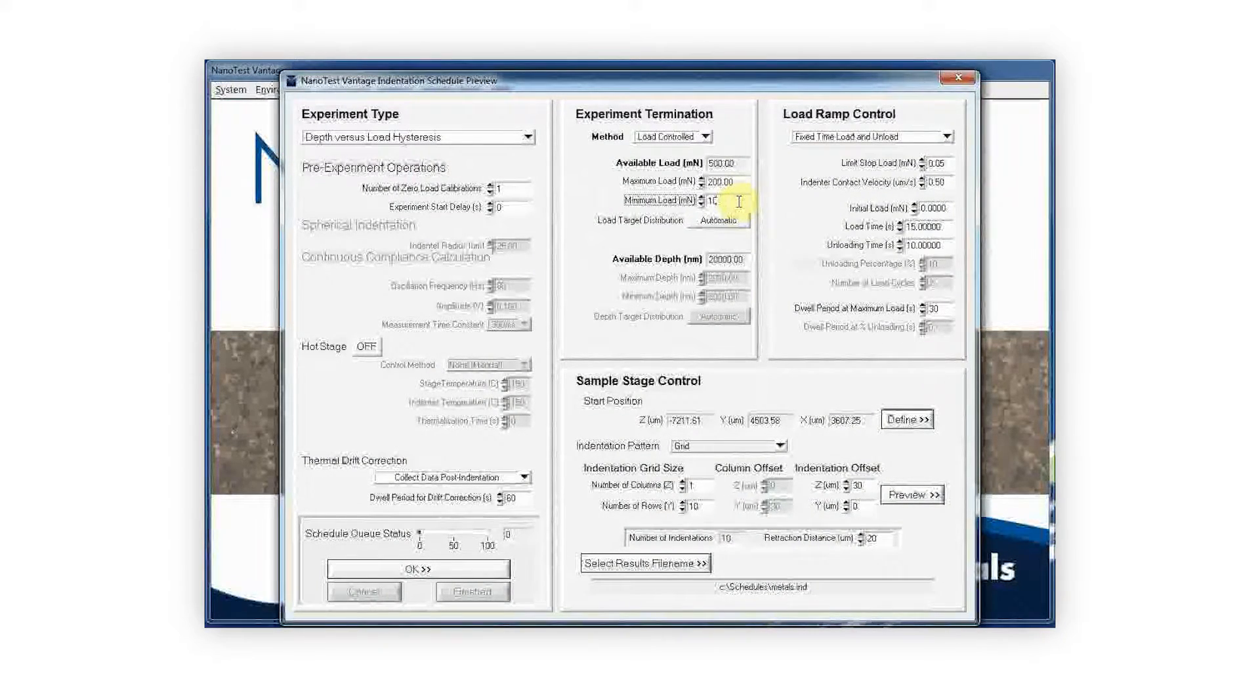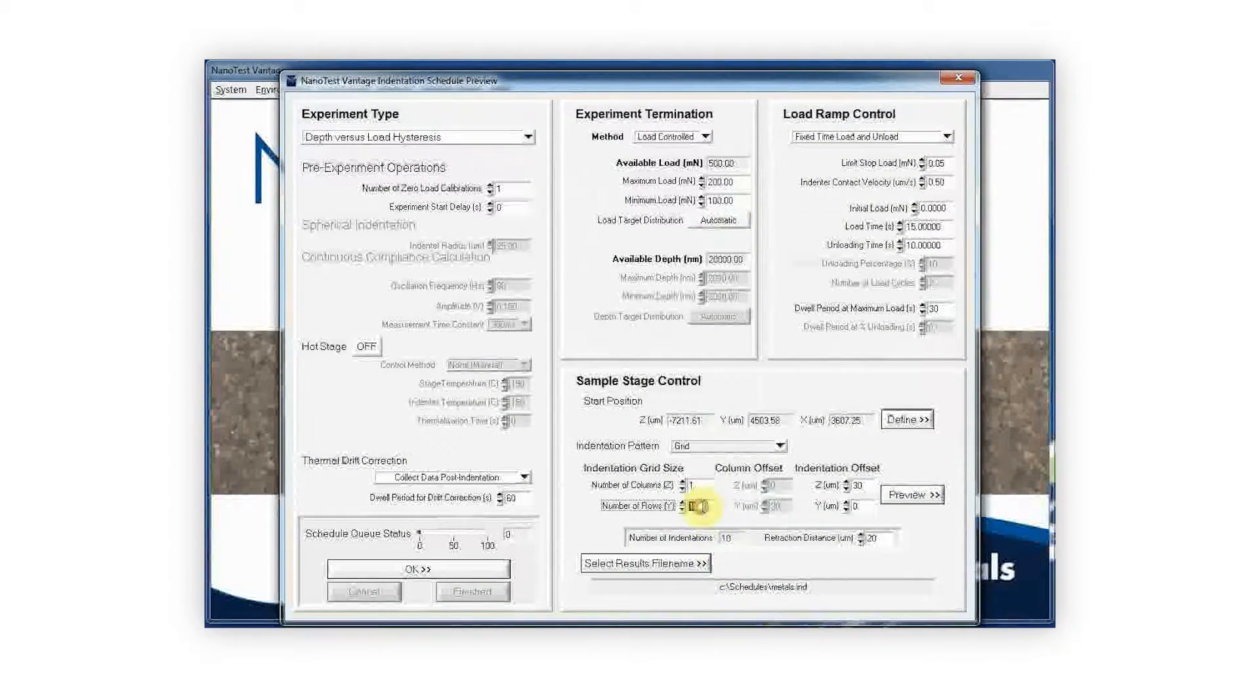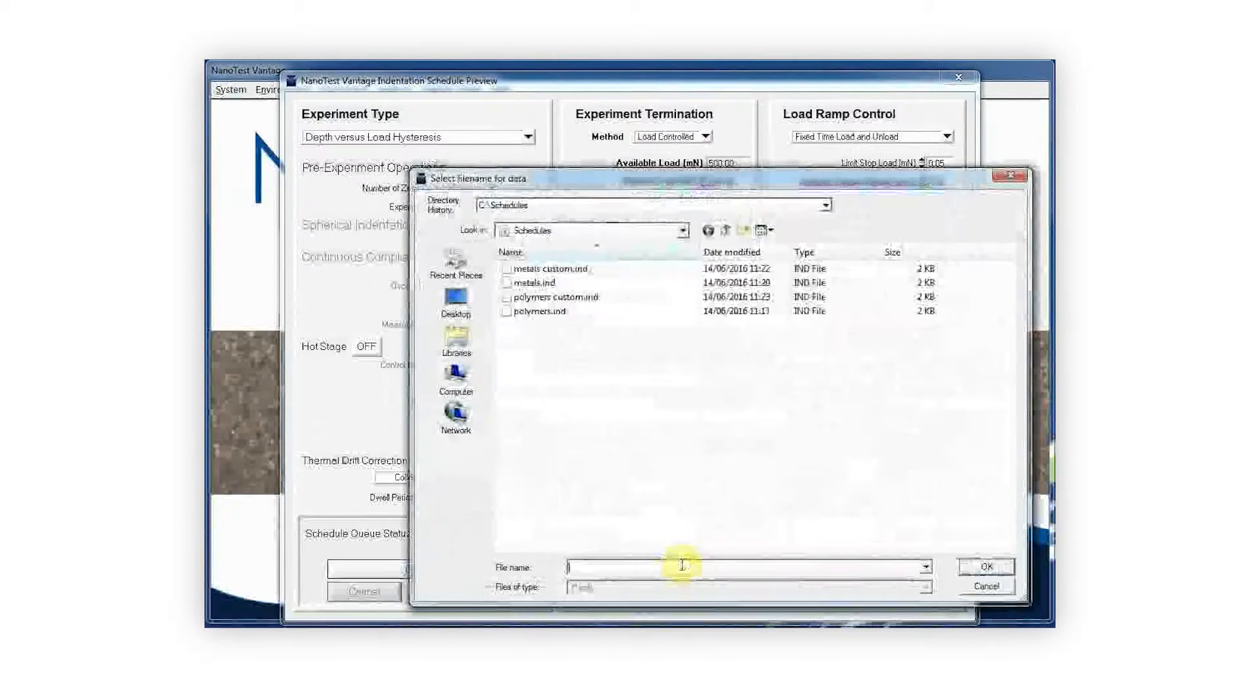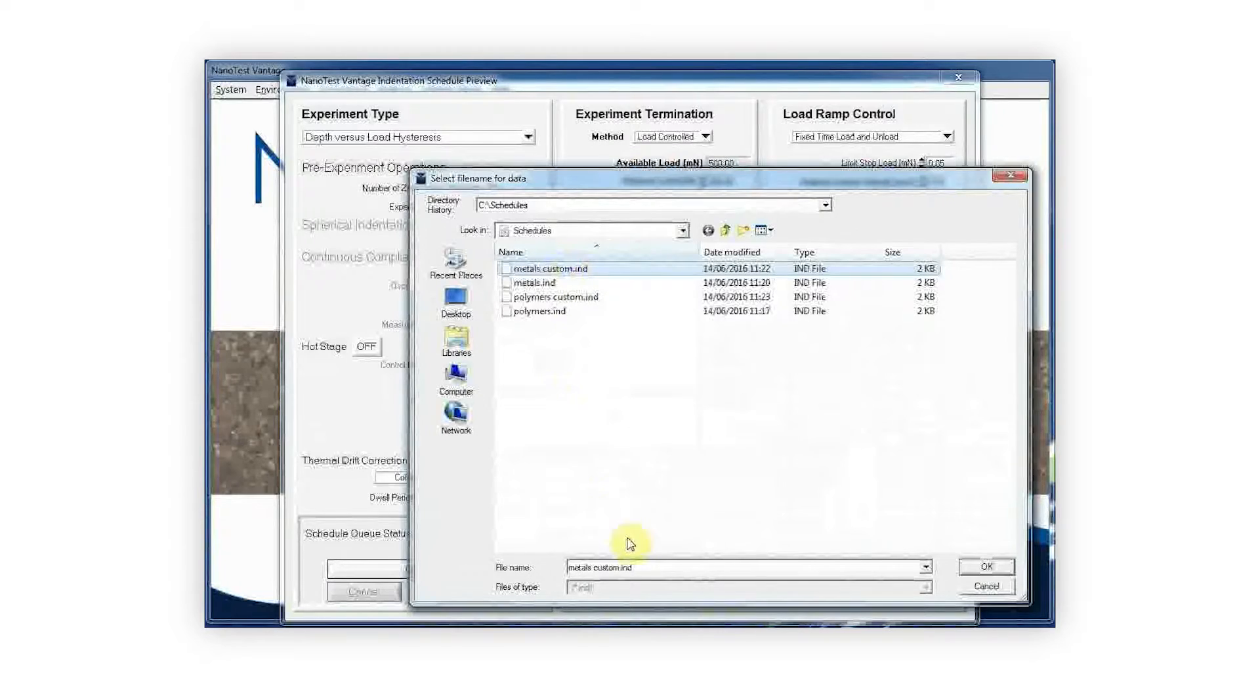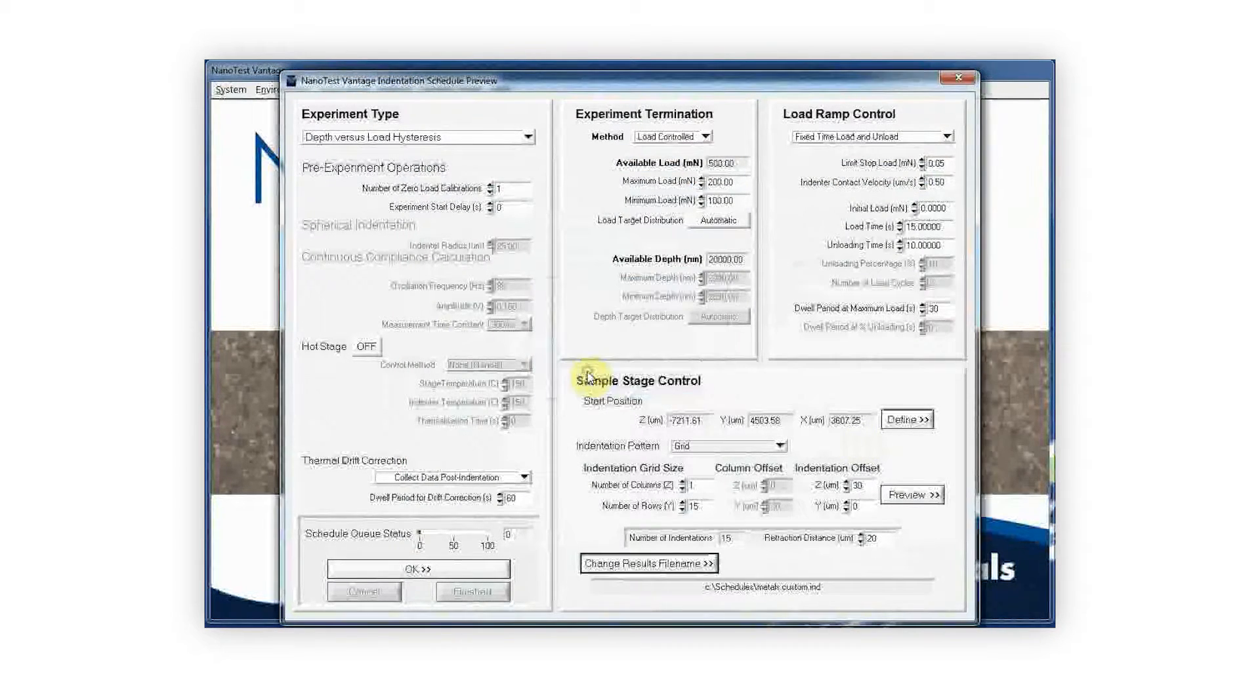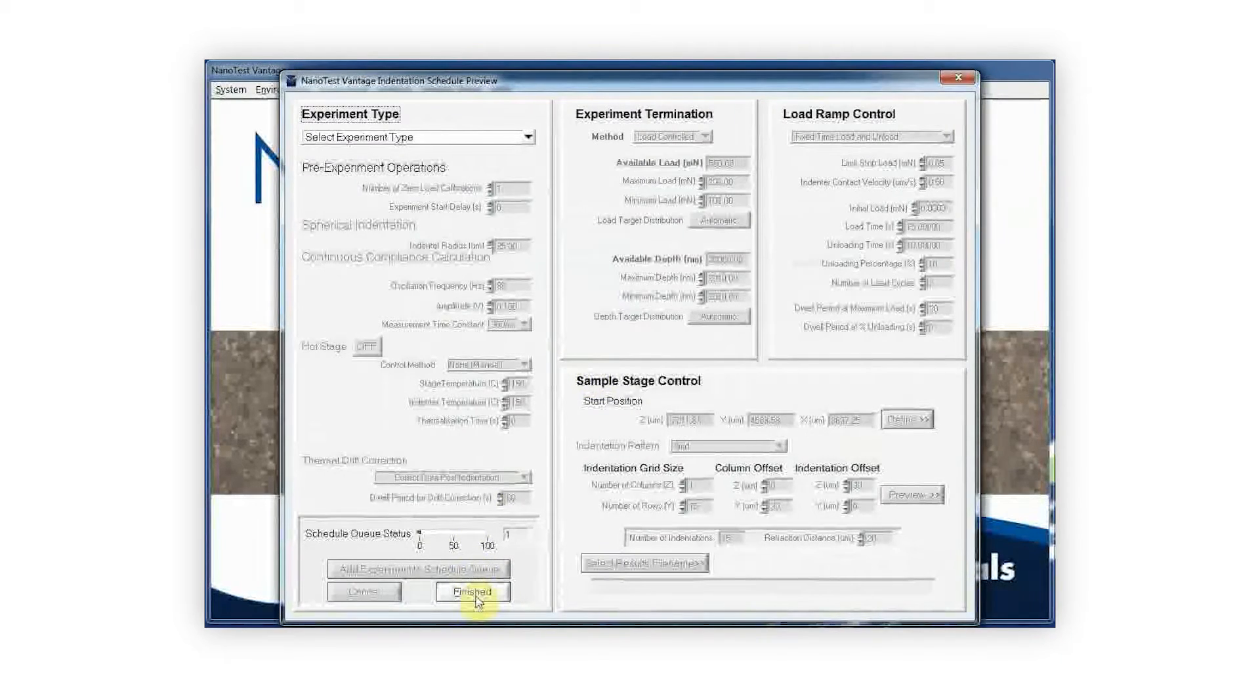When carrying out a large scale study, the same experiment often has to be repeated on multiple samples. With the NanoTest software, commonly used experimental parameters can be saved and then imported again in future, saving time when setting up experiments.